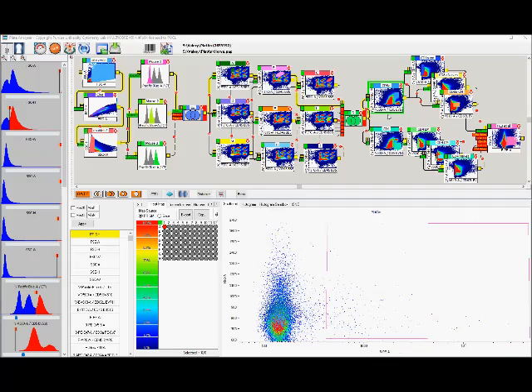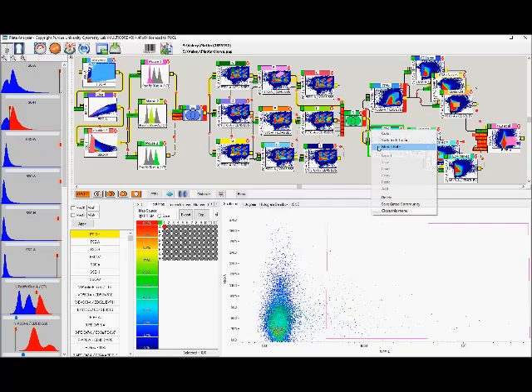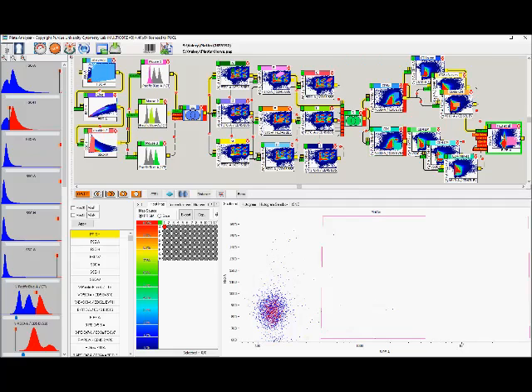Okay, so now we move on to the CD8s. Let's make the CD8 modal, and let's make the CD4 modal, which means that it will restrict everything but here. And let's go over here now and look at your EM, naives, and CMs. So here's the EM, here's the naives, here's the next one.